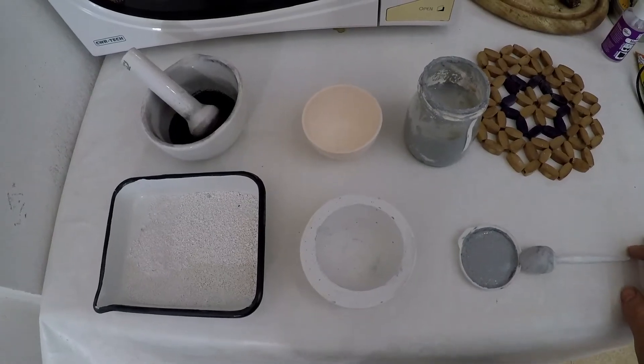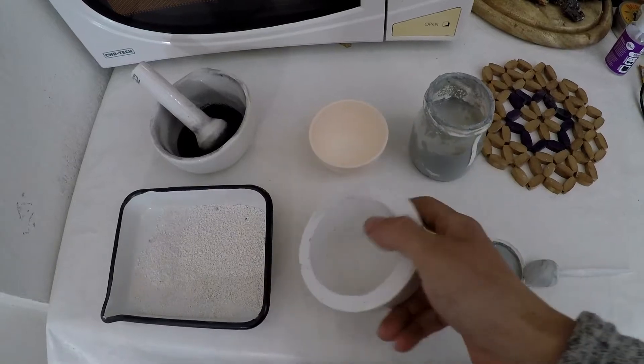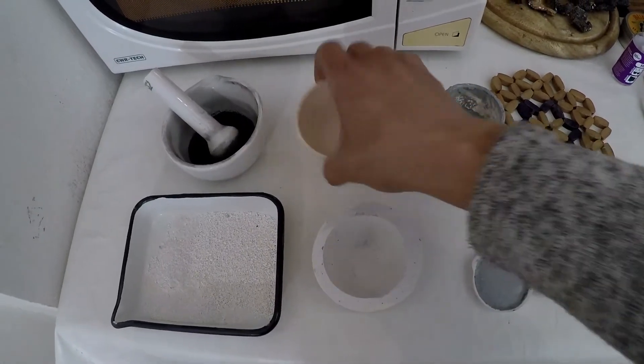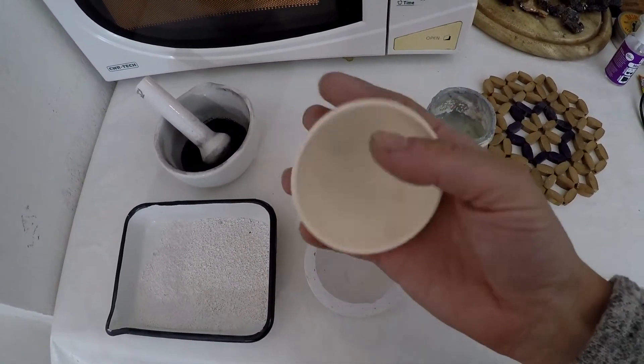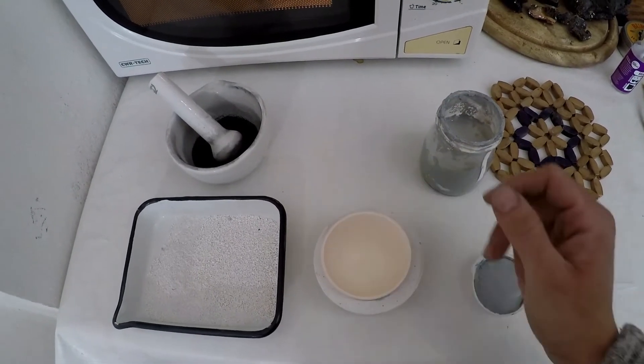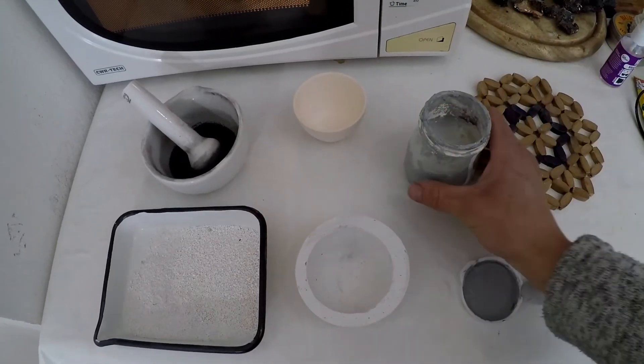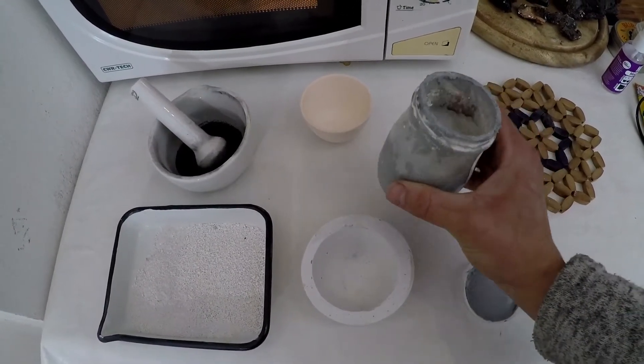In this video I'll be making some new crucibles by slip method. In my hand I'm holding a plaster mold and a porcelain chemistry crucible which fits my mold perfectly by shape and overall size. This is the slip I'll be using.